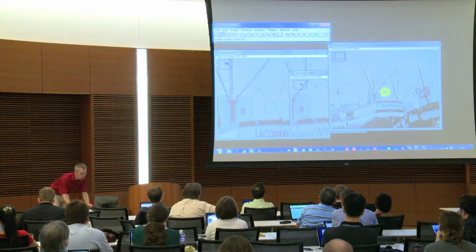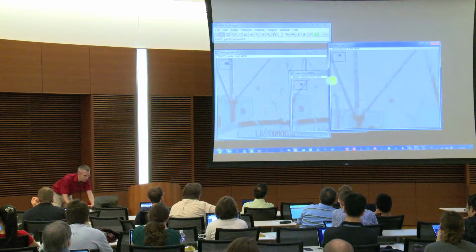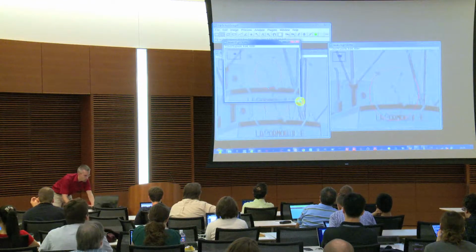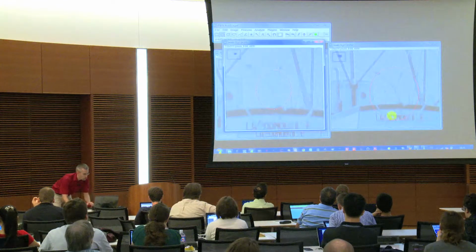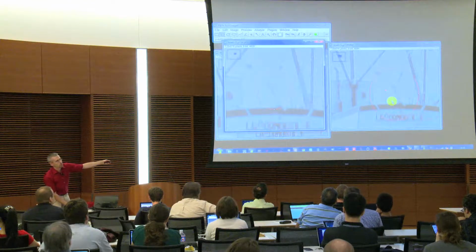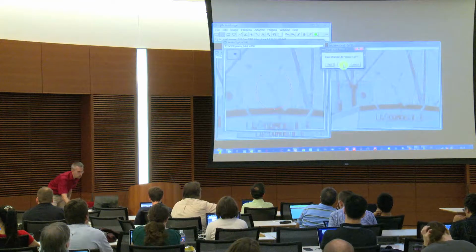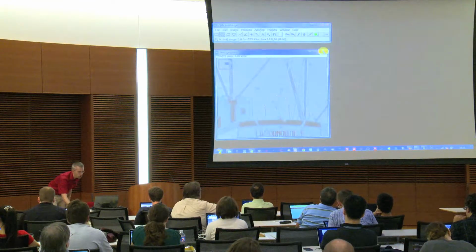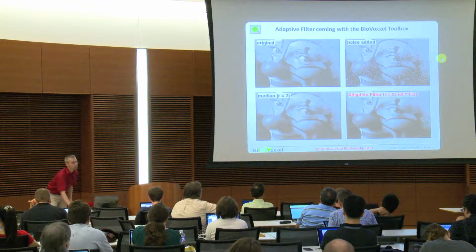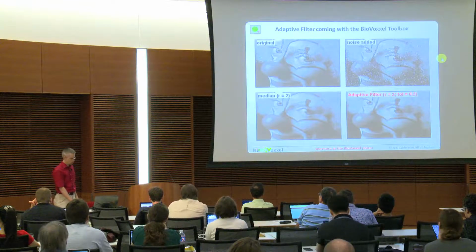And if I now press OK, and then look at this area we had beforehand, then you see in comparison to the normal median, we actually keep details a little bit better. So that is one option. Using the adaptive filter might also serve for eliminating lines. If you make the filter perpendicular to the line, a very thin line, a pixel line, you might be able to remove that.